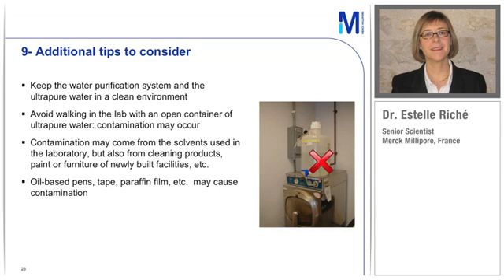Another small tip is, once you collect water from a system, try not to walk around in the lab with your open container, because it will increase the risk of contamination from the lab air. So if you can, then collect water in a bottle, in something you can close before you walk in the lab with it. Another thing is that not only solvents in the laboratory can contaminate water.